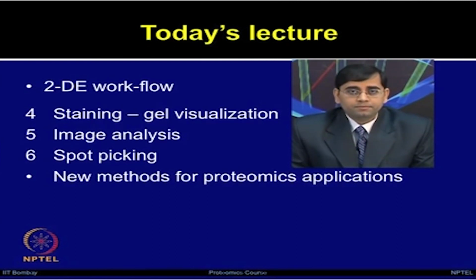In this method, you mix the Cy dyes together and separate the proteins on one gel itself. SYPRO Ruby is one of the very sensitive stains, and this stain is also used for looking at different types of protein patterns, such as it can be used for dual staining.